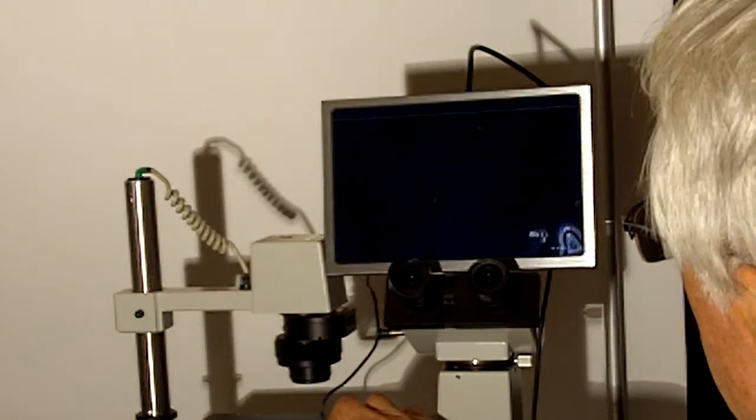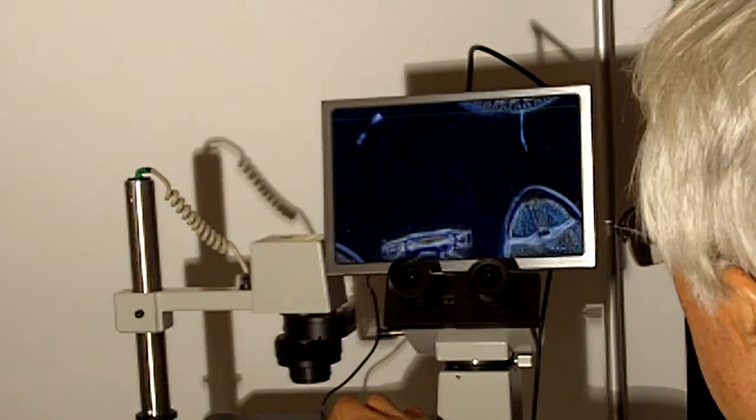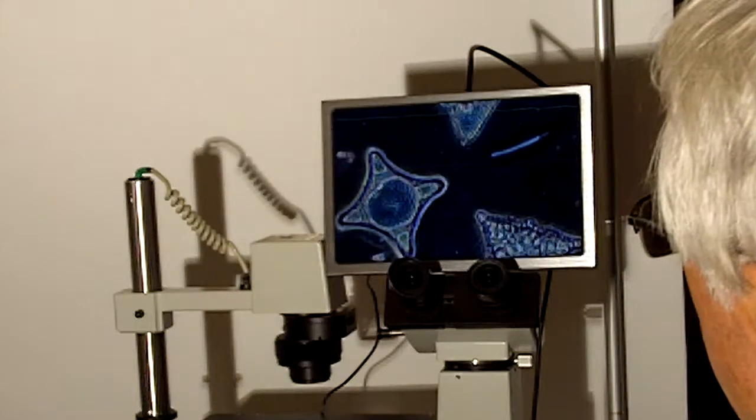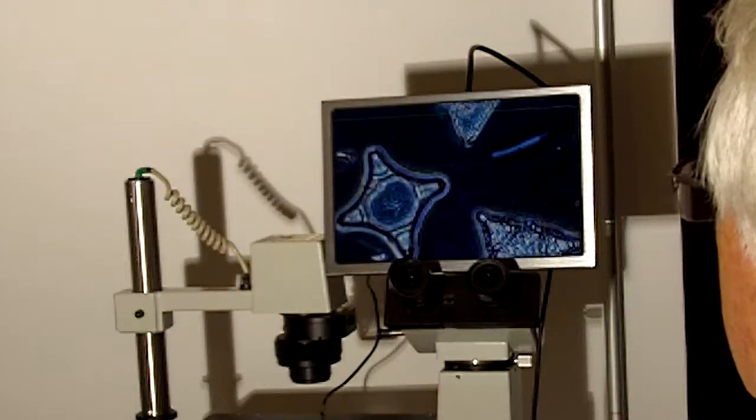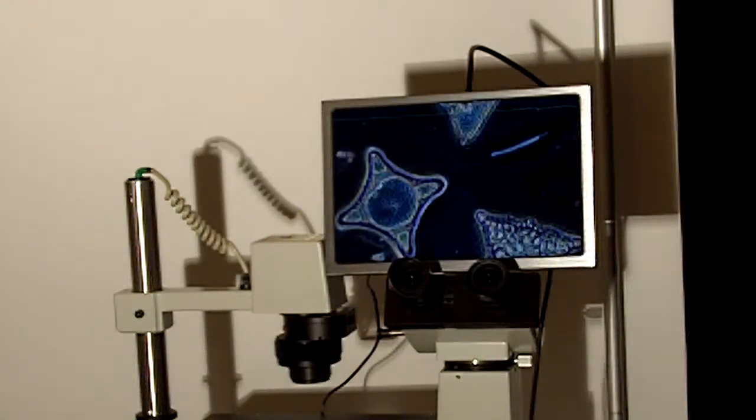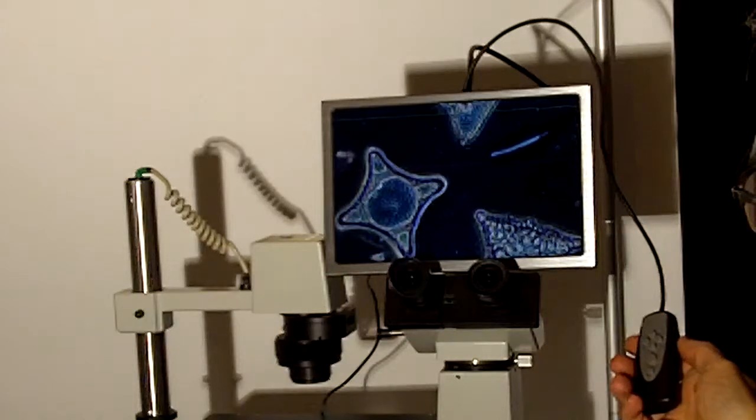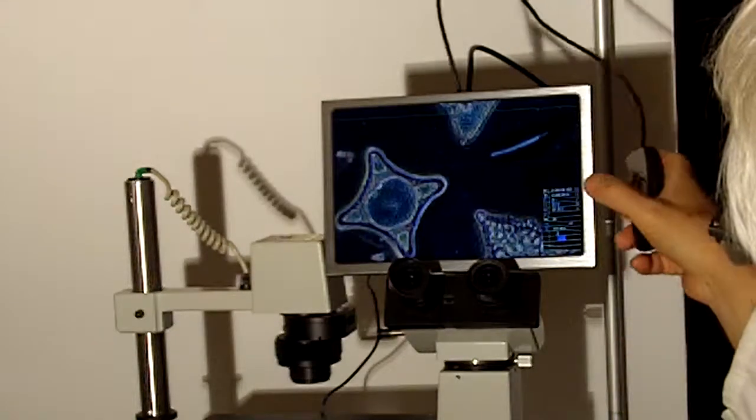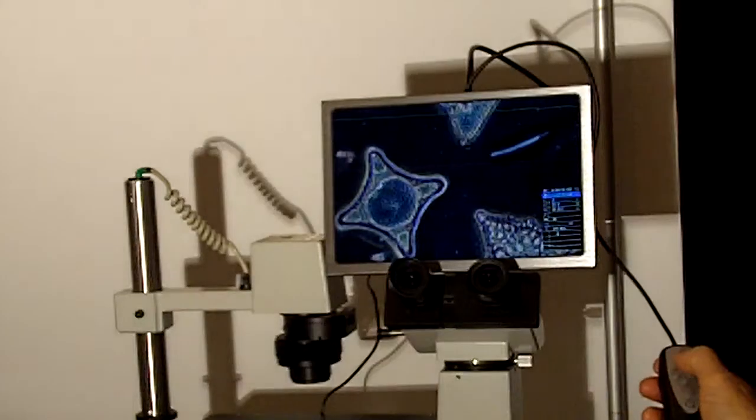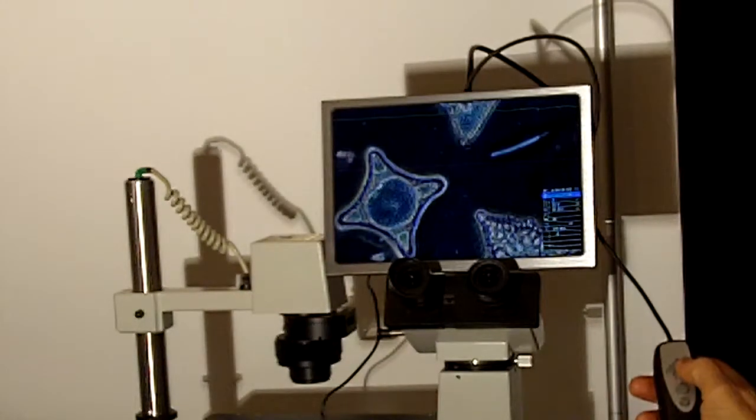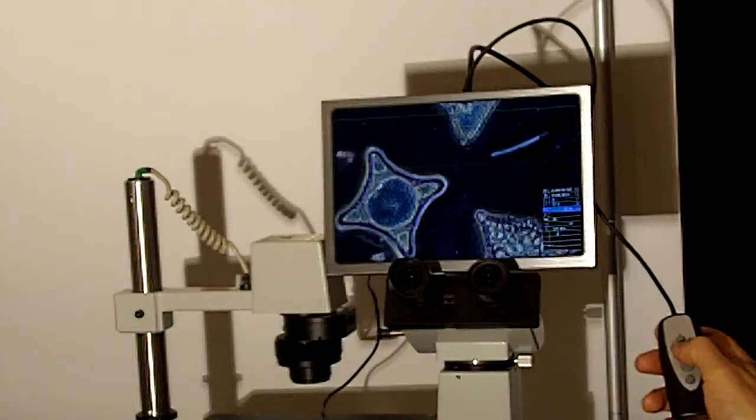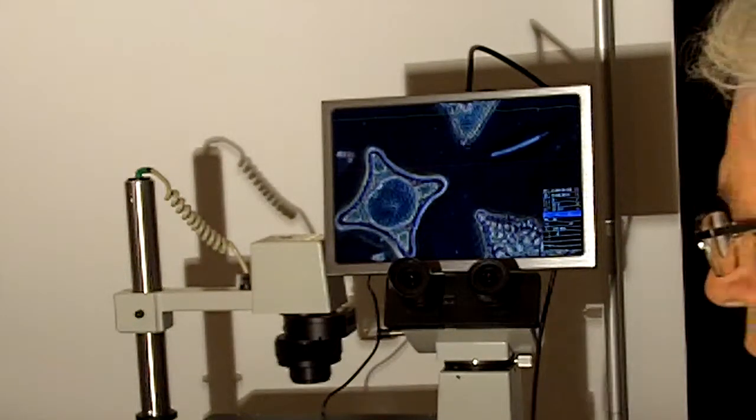This is running at 60 frames per second, which is really nice because there's no herky-jerky image delay. This is a 40x objective, though we could also dial in lower power objectives. With the remote control, we can bring in the menu screen, which displays in the lower right-hand corner, and adjust the usual camera characteristics such as contrast, brightness, red, green, and blue.